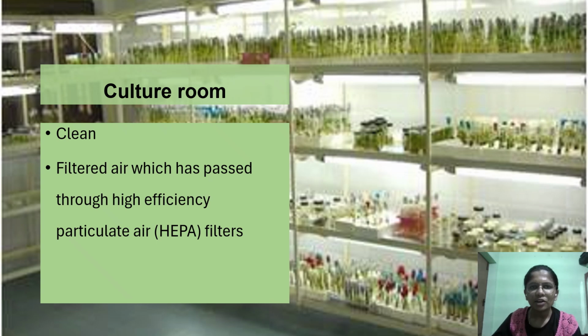This is a very important topic: sterilization and how to maintain aseptic conditions, what the sterilization techniques are, which are the possible ways of contamination and how to avoid this.